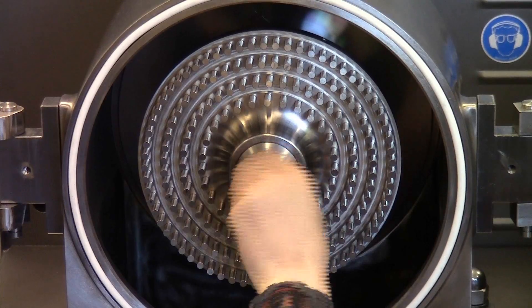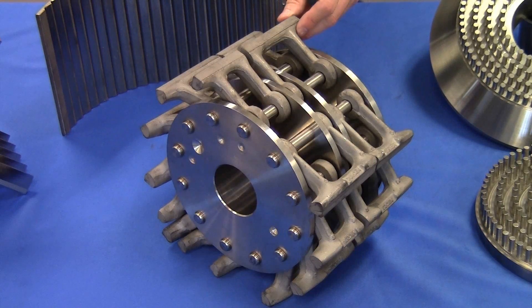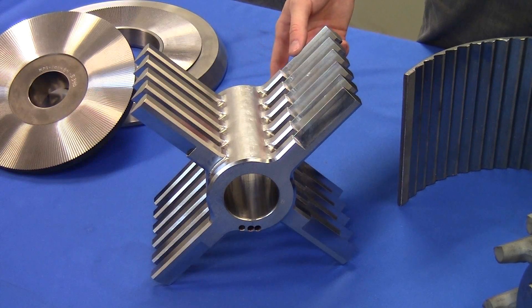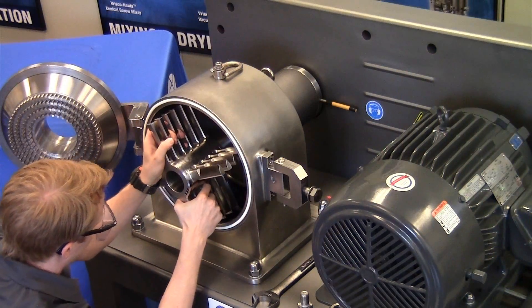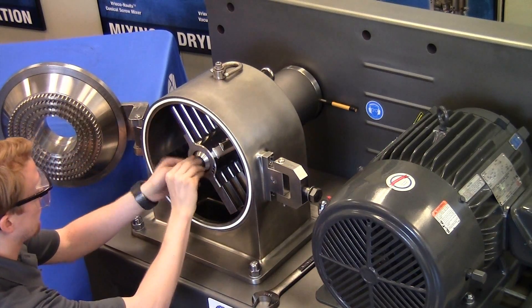The pin rotor is typically used for waxy or oily materials or when you're trying to produce less fines. The LFS rotor is used in applications where impact type grinding is important. The rigid knife rotor assembly is typically used for fibrous or coarse granulation. The rotor itself is reversible so you can use it either way — with the sharp end or the blunt end for finer or coarser material accordingly.